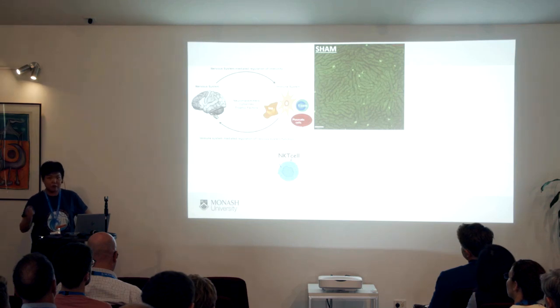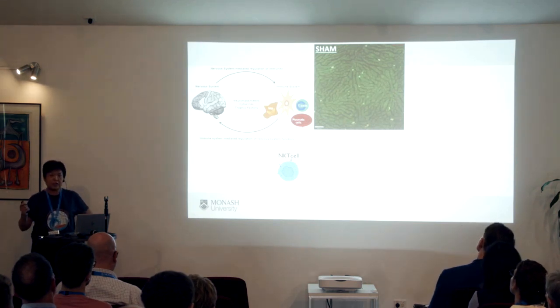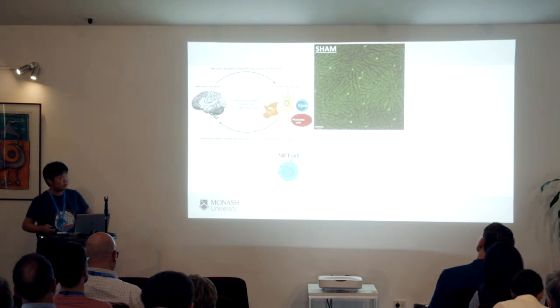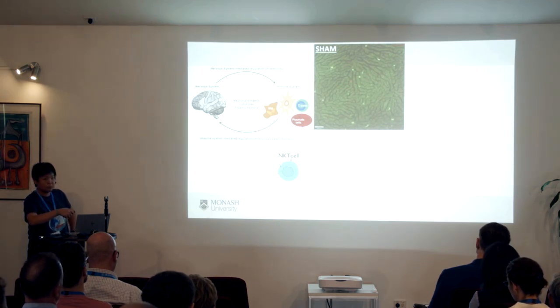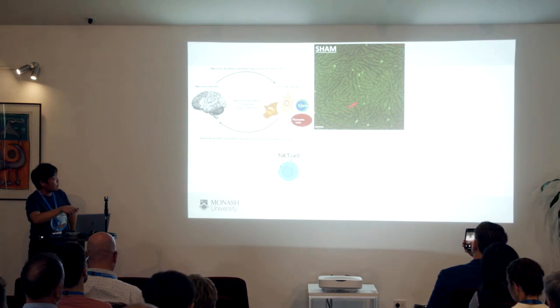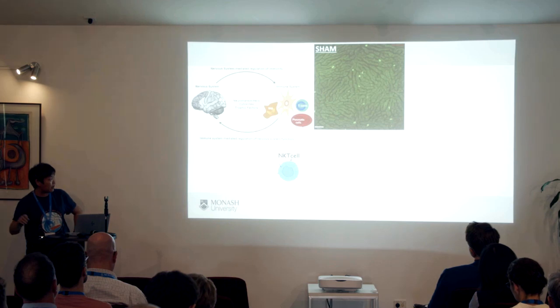They're bidirectionally regulated, in fact. And a lot of immune cells actually express adrenergic receptors, so receptors that can respond to neurotransmitter. Here you can see invariant natural killer T cells trafficking through liver sinusoids, so blood vessels of the liver. They are patrolling the sinusoids looking for danger for us, any bacteria.